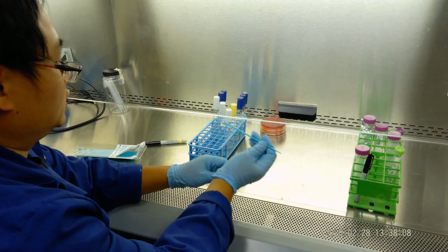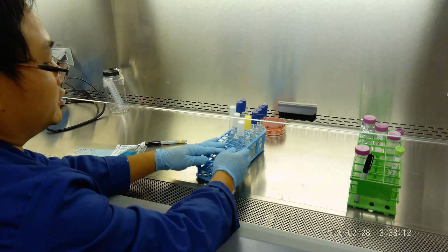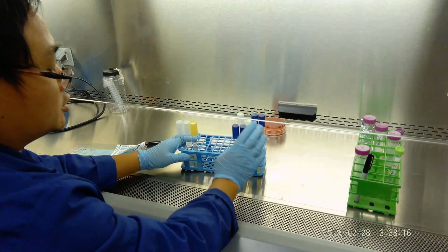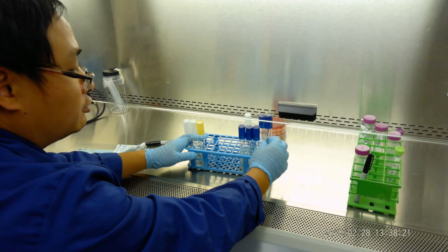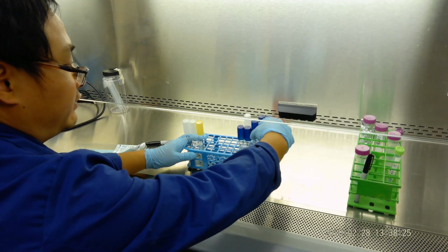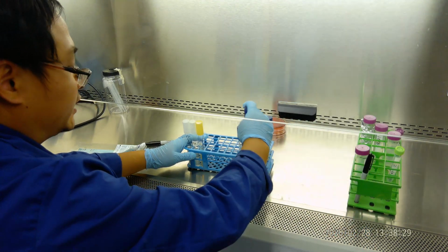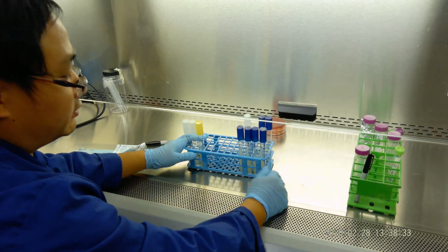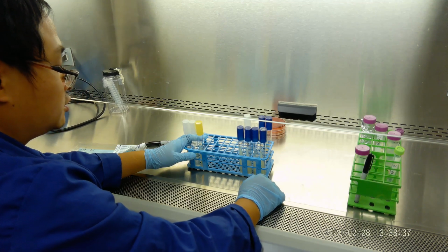Okay. So all these will be incubated at different temperatures. You give these to the TA, and each will be at a different temperature: 4 degrees Celsius, 25 degrees Celsius room temperature, 37 in the incubator, and 55 in a little bit warmer incubator. So we want to see whether the mild heat will kill E. coli. Okay, so that's all we're going to do. So thank you very much.